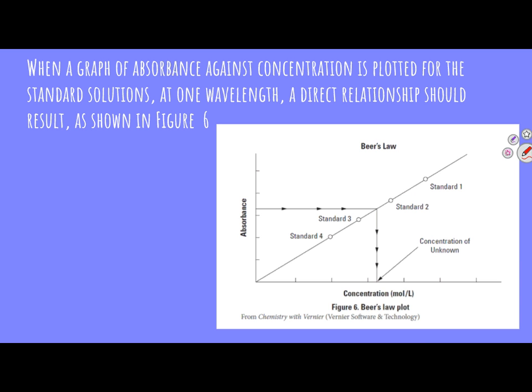You would say, there's the absorption, track, that's where it hits the line, track, there's the concentration. So the value of a calibration curve is it can give you ultimate predictability of any unknown solution in terms of Beer's law. Ultimate predictability, taking absorption and finding concentration. You good with that?